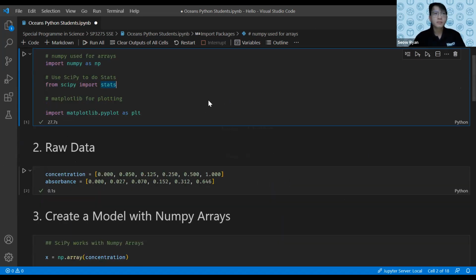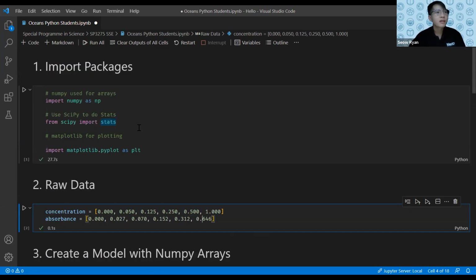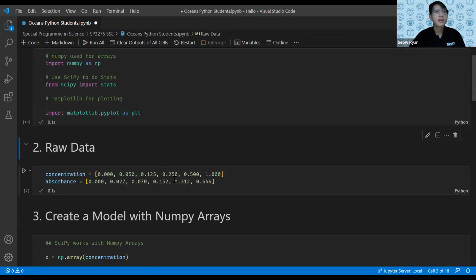Okay, so first things first, we create the raw data. I did the hard coding here because there are not a lot of values, but of course, if you have a large data set, please go ahead and use pandas, pd.read_csv, whatever. I don't remember such things, but yeah, just do whatever you want. Okay, so create the raw data. I need to run this.